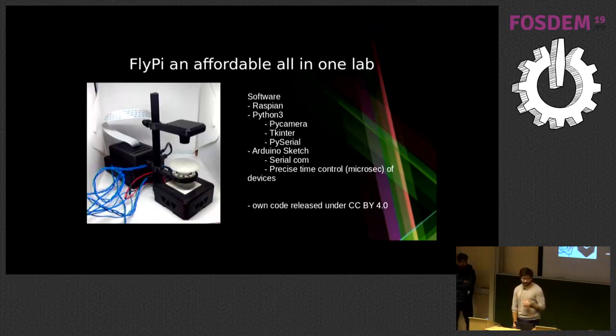And in terms of packaging, in a way, we're kind of stuck to the same hardware all the time, right? So it's a little bit easier: once we have everything working, we just prepare an SD card image and make it available online, so people can just download the SD image.